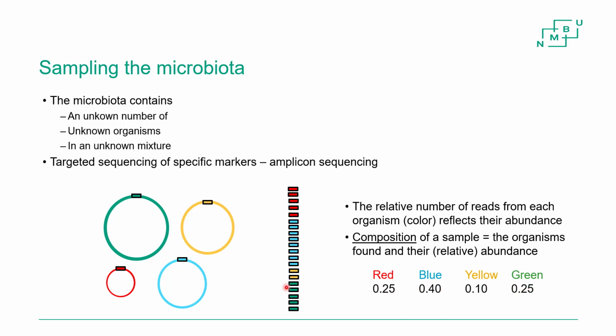It's a relative abundance, because the total number of reads here is not interesting at all, because that's how deep we have been sequencing. That has nothing to do with how abundant they were in the first place, these organisms. Because remember, we did some amplification here. So we don't really see that original abundance. It's only relative. How much do you have of one compared to the others? Whether there were originally many or few bacteria, that's a completely different type of question. It's impossible to answer in this way. Okay.